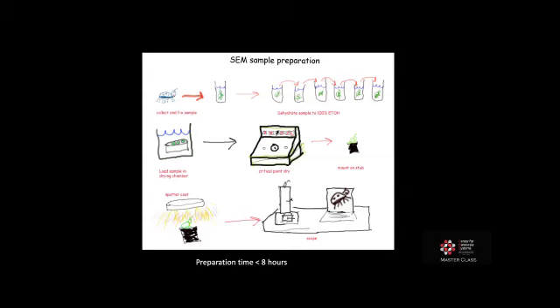Sample preparation is very simple. It can be done in less than a day. As always, we start with fixation, then full dehydration to 100% ethanol.